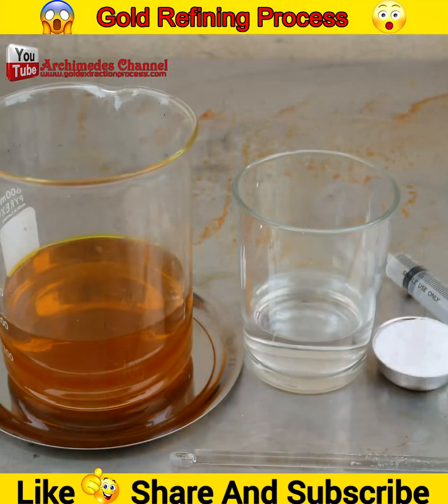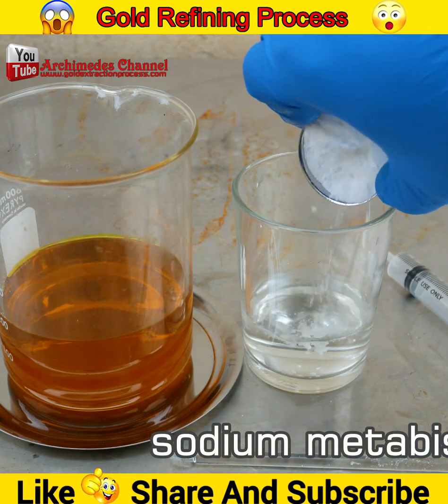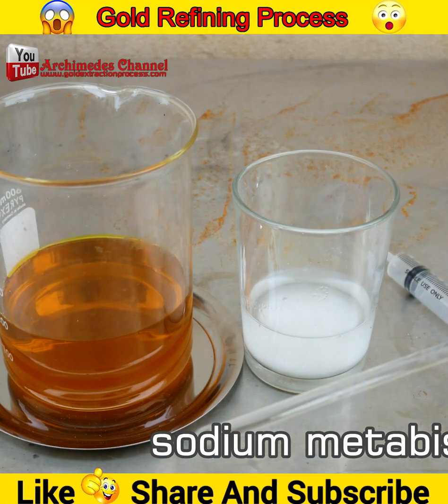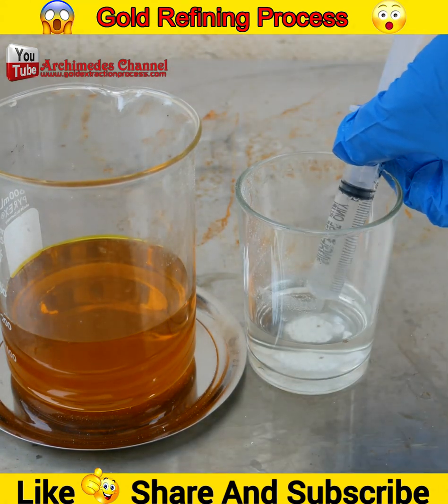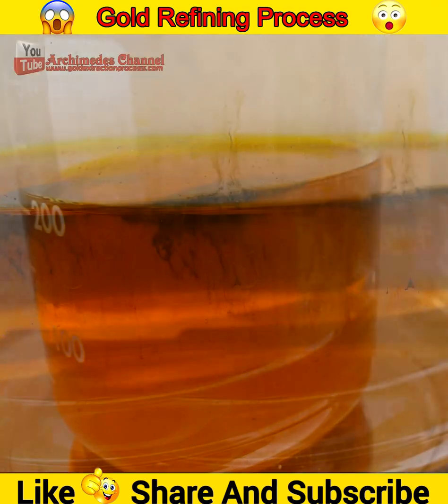Use sodium metabisulfite to precipitate gold out of the aqua regia solution — you will get gold sludge powder that looks like mud. Sodium metabisulfite, also known as sodium bisulfite, is an affordable option. Mix sodium metabisulfite with water and slowly add it to the gold solution; you will see the formation of gold mud.